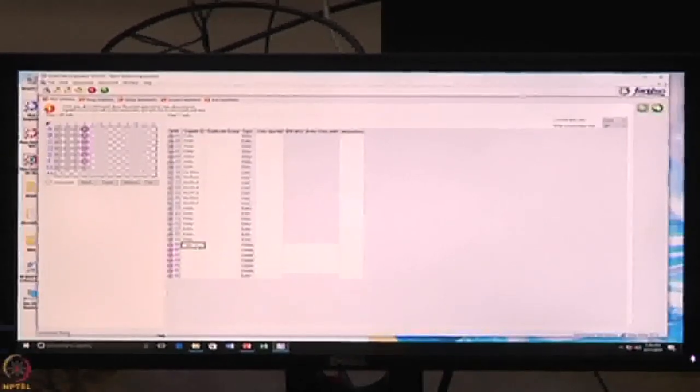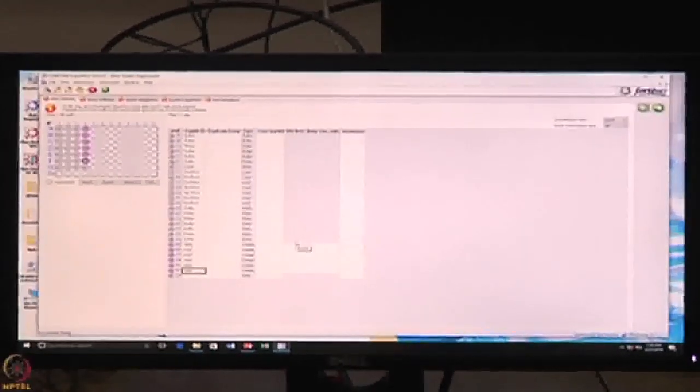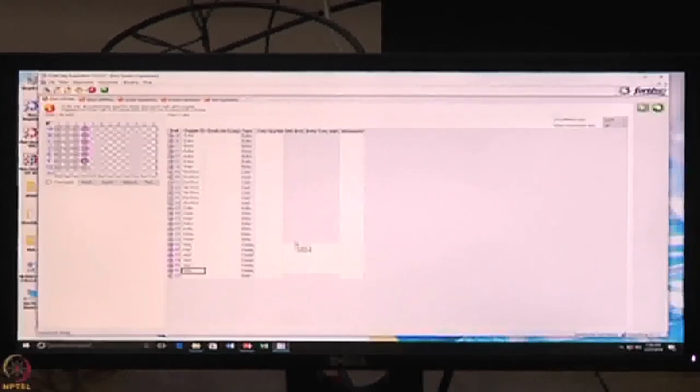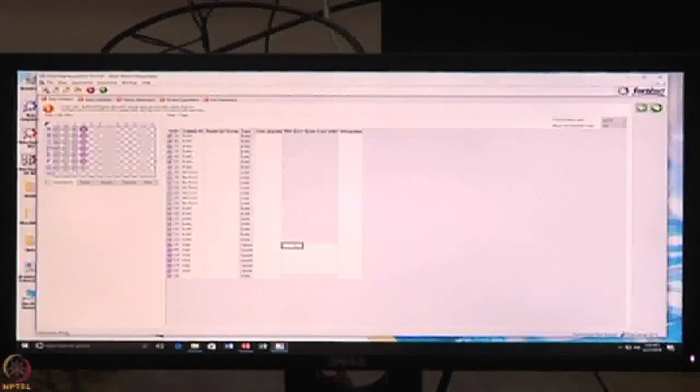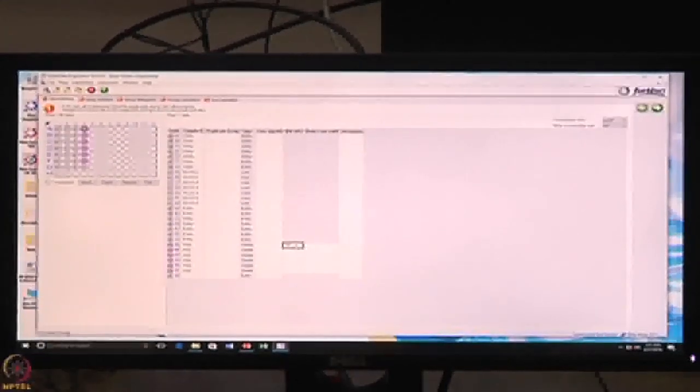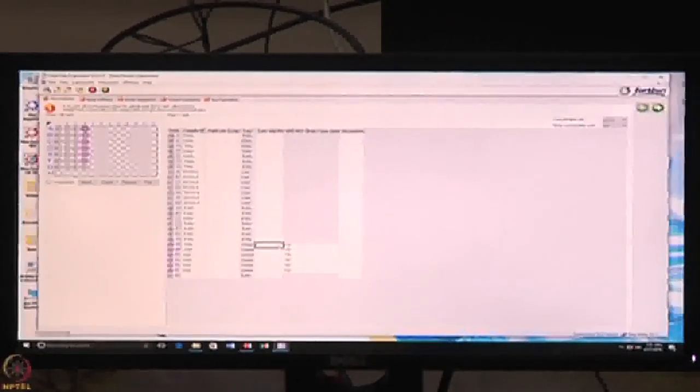Here the important thing is mouse IgG. You have to mention your concentration, because if you don't feed the concentration, you will not get the KD value. Concentration is one of the parameters when you are calculating the KD and the kinetic rate constants. The molecular weight of a general IgG is 150 kilodalton, so we have to feed 150 kilodalton here. Then control C, once again you require all the parameters. My starting, top concentration is 10 microgram per ml.